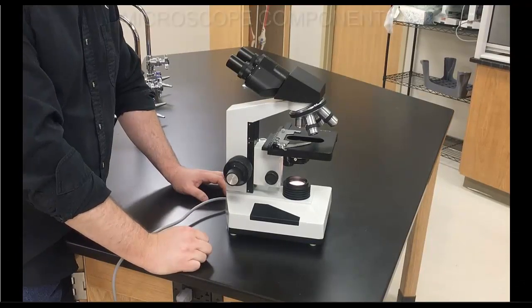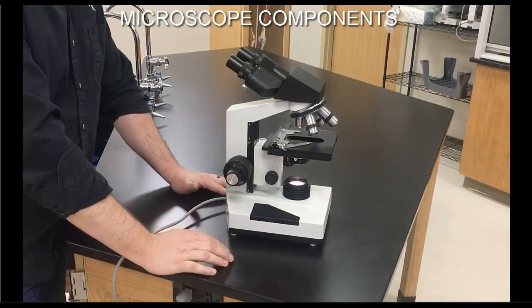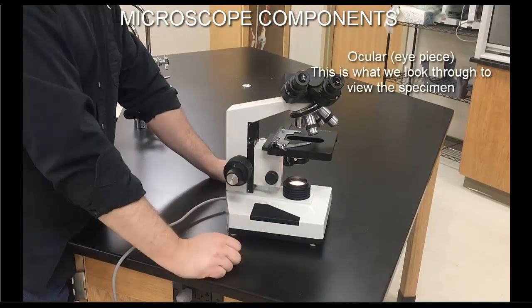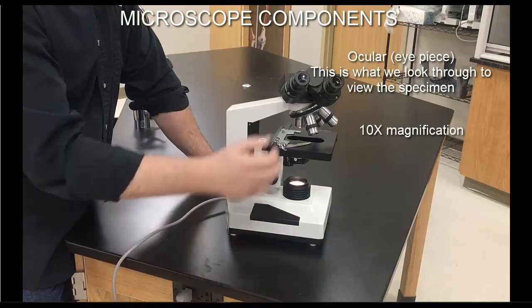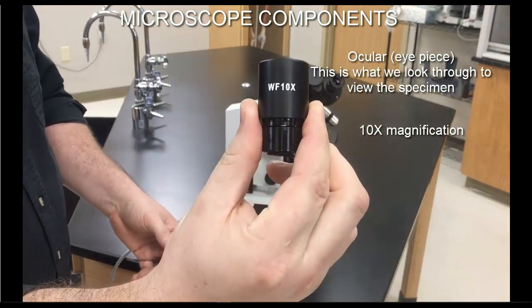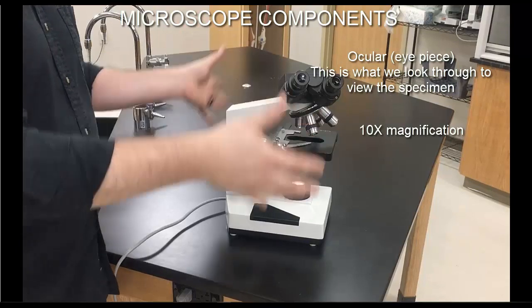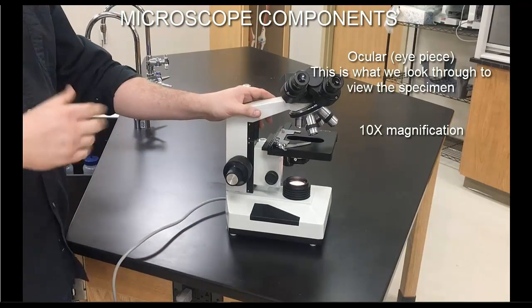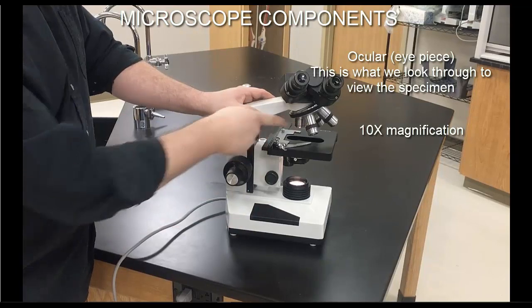Now I want to walk you through the different components — write these down and take notes. The first component is the ocular or eyepiece. These are what we look through to view the specimen. They also have a built-in magnification, most often 10x — you can see the 10x indicator on the ocular itself. The microscope magnifies the specimen twice; that's why it's called a compound light microscope. It uses visible light and is compounded in magnification: once with the objectives, and a second time with the oculars.